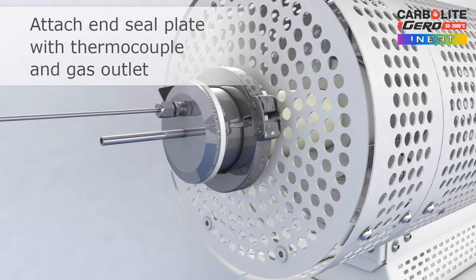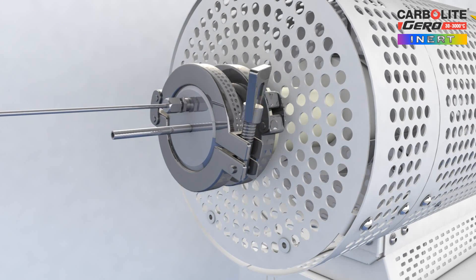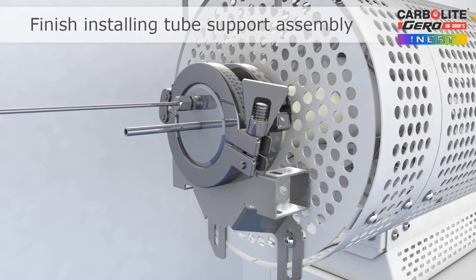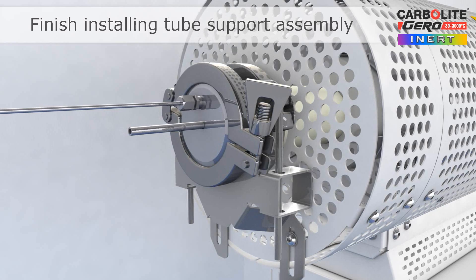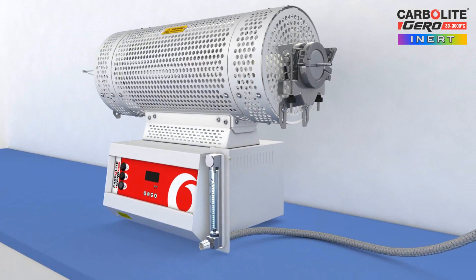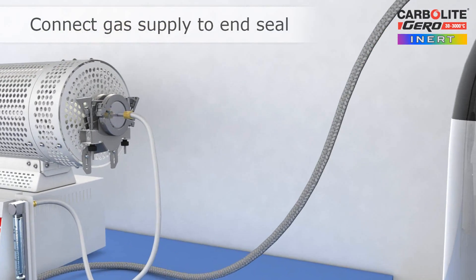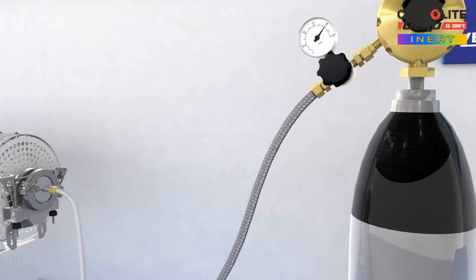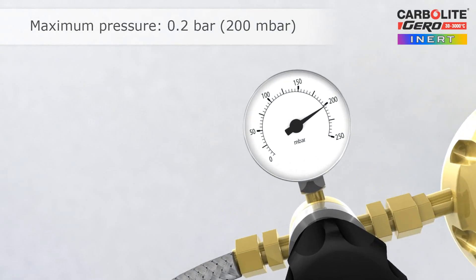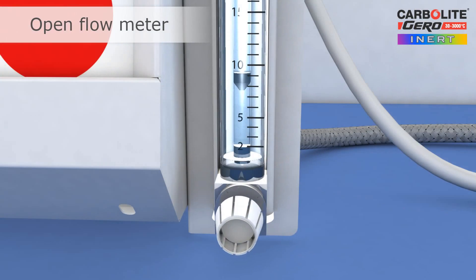The end seal plate is fitted and clamped in place to provide a gas-tight assembly. The remainder of the work tube support assembly is fitted. The gas supply can now be connected. The maximum pressure for the gas supply must be regulated to 200 millibars, and a flow meter is used to set the gas flow rate.